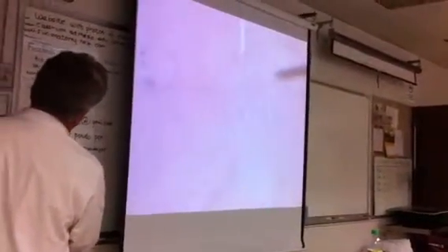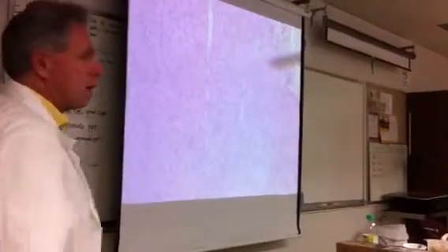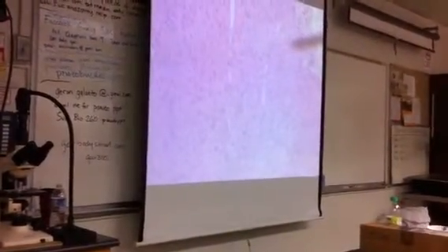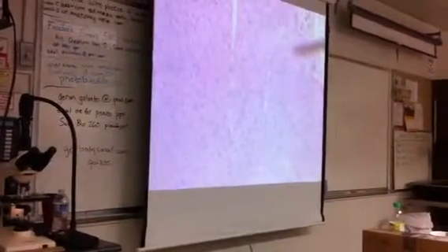The distinguishing characteristics of smooth muscle, which is what all this is on this slide, is you can see the little blue dots. Those are the nuclei of the cells. No striations, no intercalated discs. So if you see all these nuclei, that's smooth muscle. Remember, smooth is involuntary, and it's found in the walls of our hollow organs, things like the bladder as well, but we most associate it with the GI tract, the stomach, the intestines and things like that. So it's smooth muscle: nuclei, no intercalated discs, no striations.